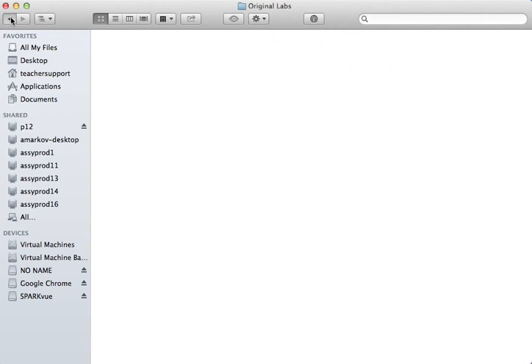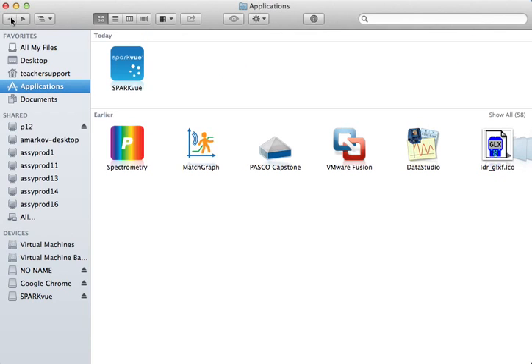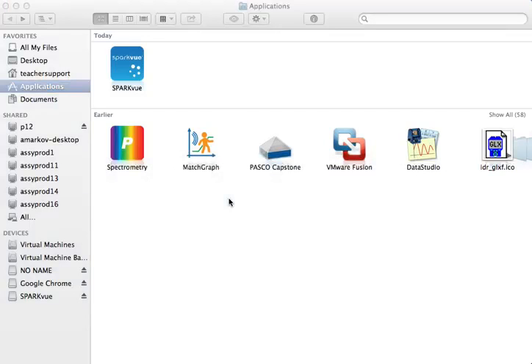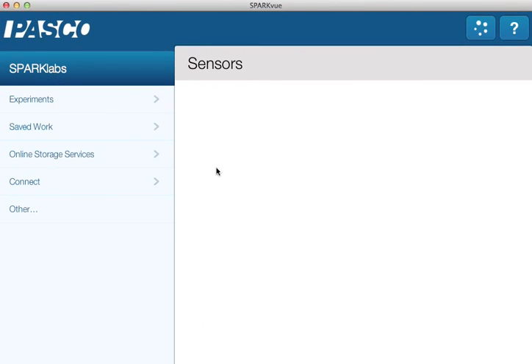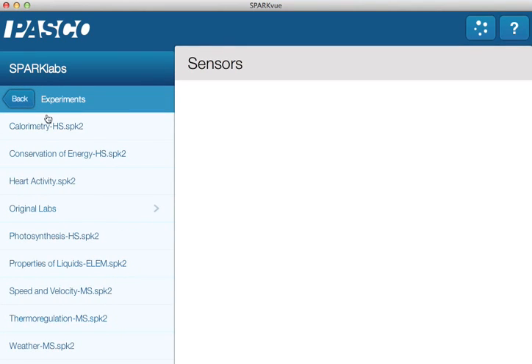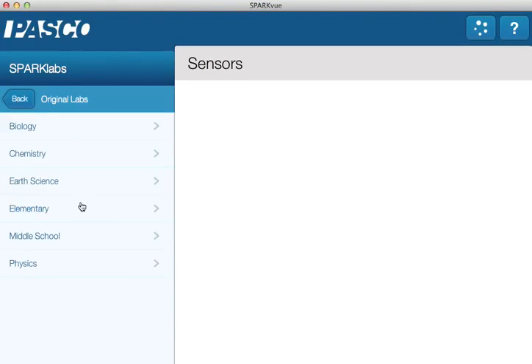I'm now going to back out of this to go back to the original SparkView icon, and now I'm going to switch over to my SparkView application. Within the SparkView application I can click on the Experiments folder, and within this you can see the SparkView 2.0 labs as well as the original labs that I've just placed in that folder.